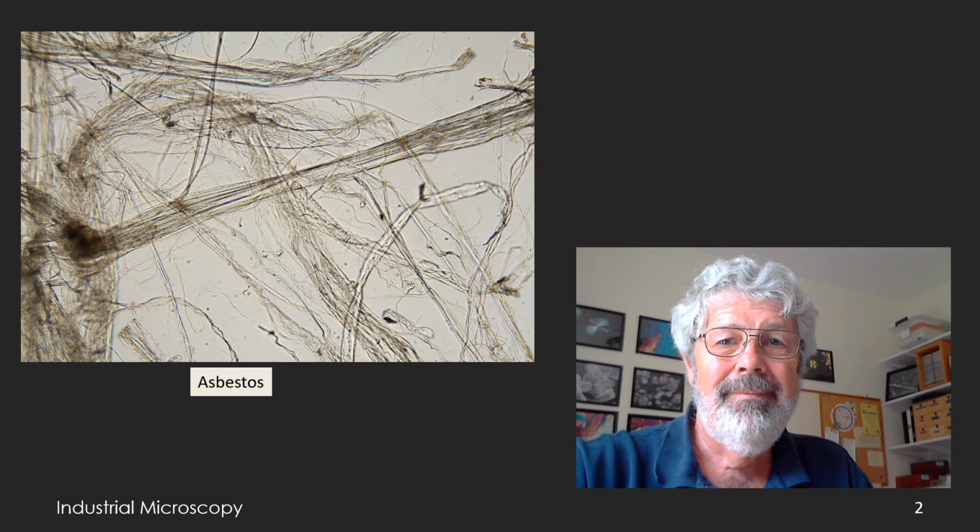In this video, I'll discuss a bit about why contamination analysis, contaminant identification, is important. Of course, the sources are pretty much everywhere. And oftentimes in industry, I've encountered the attitude that says, well, if we run our manufacturing process well, should we even get contaminants? While that's theoretically true, it seems to me that it's a bit naive, because stray particles are so common that we are going to get some contaminants, and so we need to have a way to deal with it.